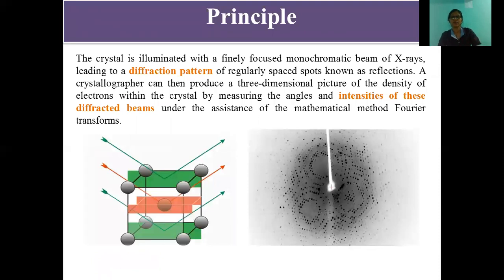Next comes the most important point: what is the principle of X-ray crystallography. The principle of X-ray crystallography is based on two important phenomena, or two important points you should keep in mind.